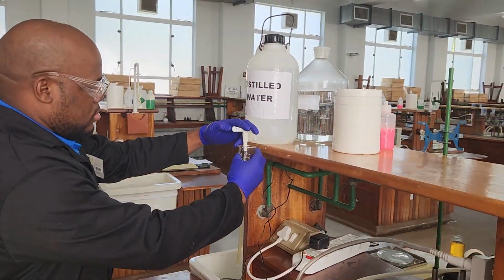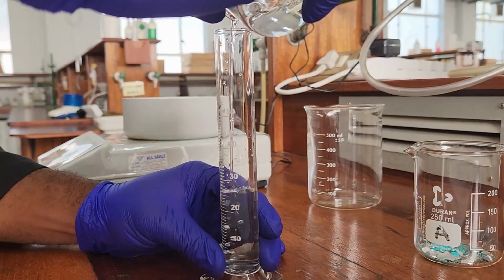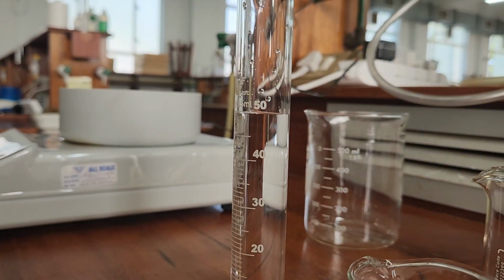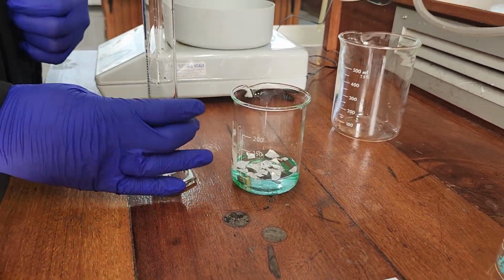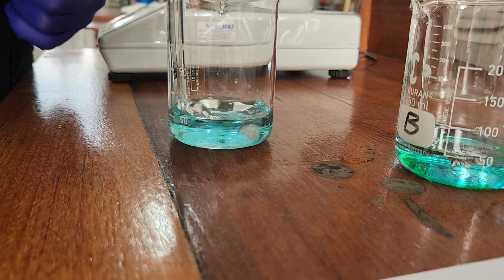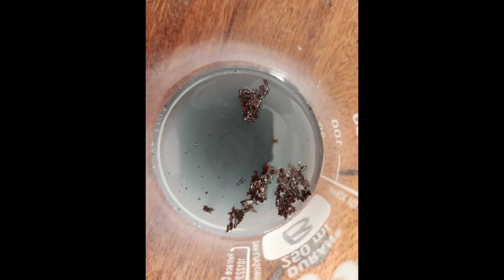Now use the graduated cylinder to measure approximately 50 cubic centimeters of deionized water and add this to each of beakers A and B. Swivel the beakers or stir the beakers alternately with a glass stirring rod. The reactions should take about 30 minutes to complete. As the reactions proceed, record any observations that you see in the data report table. This includes color changes, bubbling, etc.